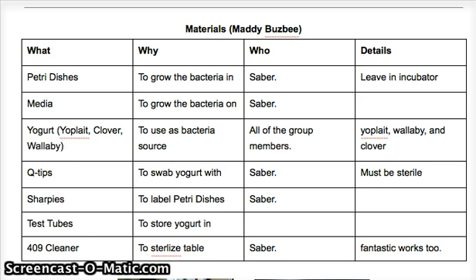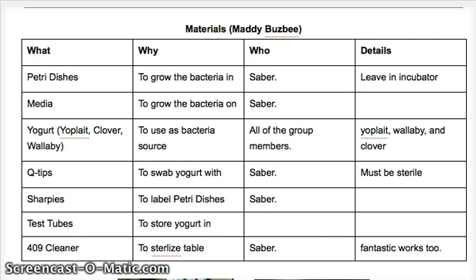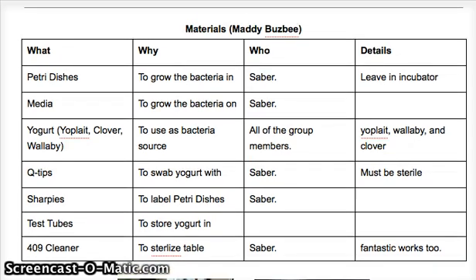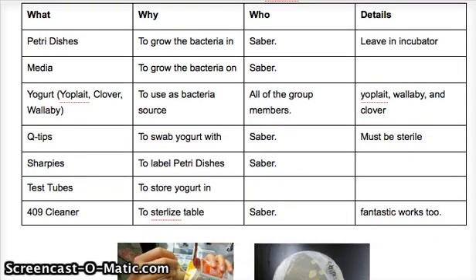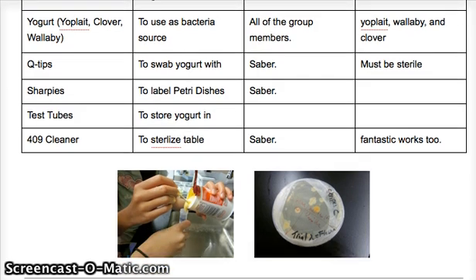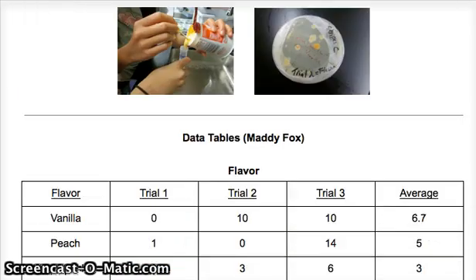For the materials, we used petri dishes to put the media in and grow our bacteria in, the media itself, and our yogurt brands: Wallaby, Yoplait, and Clover. We also used Q-tips, sharpies, test tubes, and 409 cleaner.